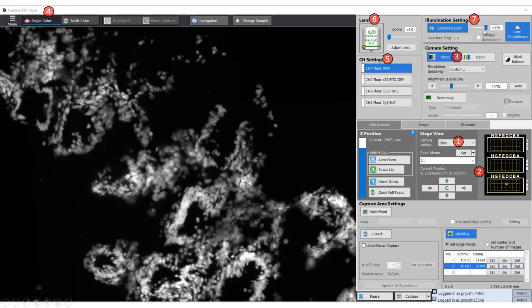And what that does is it introduces a barrier or neutral density filter to cut the amount of light which passes through, okay? And we'll talk more about that. And then is the exposure, which is for how long you want the shutter of your camera to stay open.